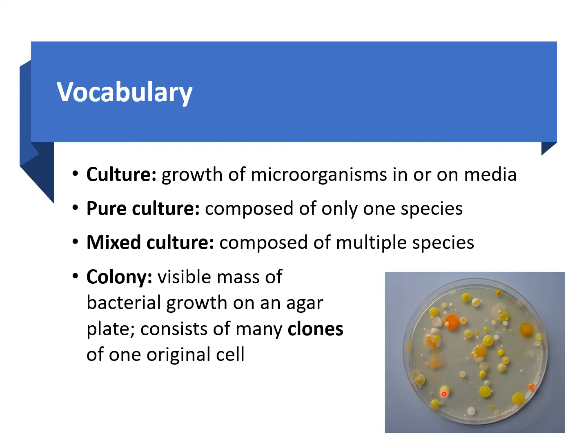And what's a colony? A colony is basically a mass of bacteria, consisting of many clones of one bacterial cell. So one bacterial cell keeps reproducing and replicating itself, and you get this visible mass on your plate, and we refer to that visible mass as a colony.